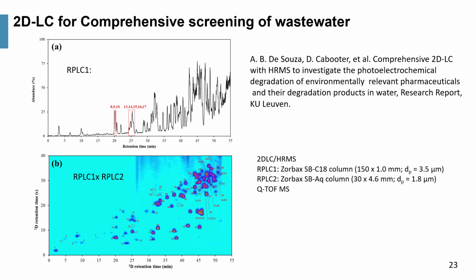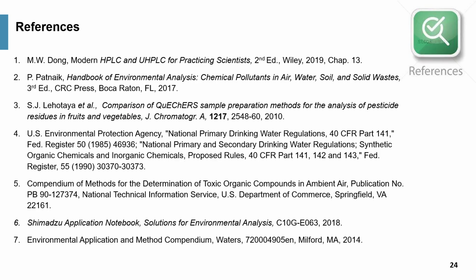Some research groups actually demonstrate the use of different orthogonal techniques, such as something called HILIC, combined with a mass spec compatible reverse phase, and then end up with mass spec detection. This is the reference list on this topic.